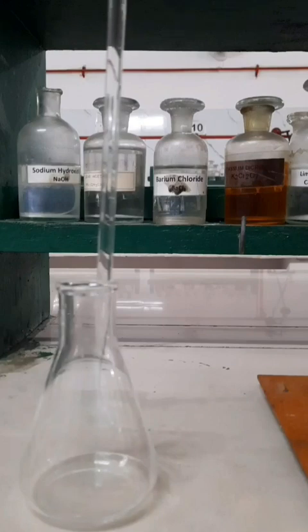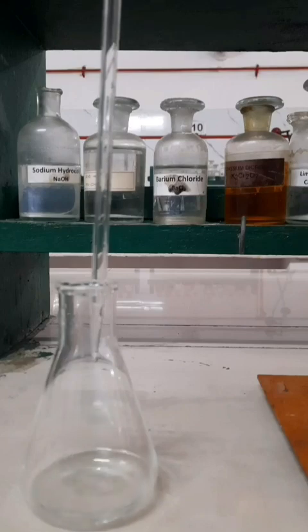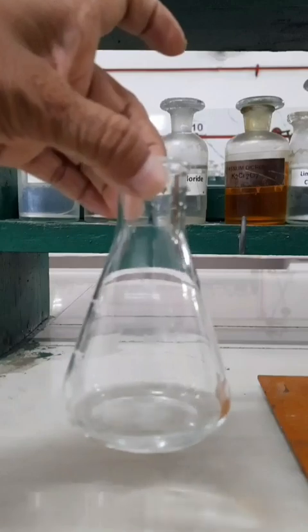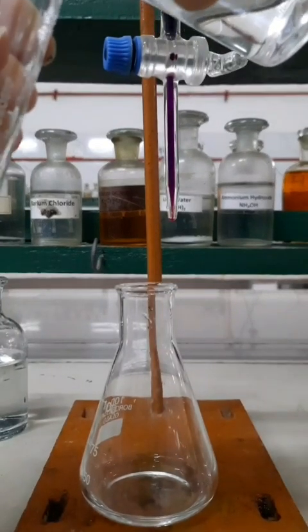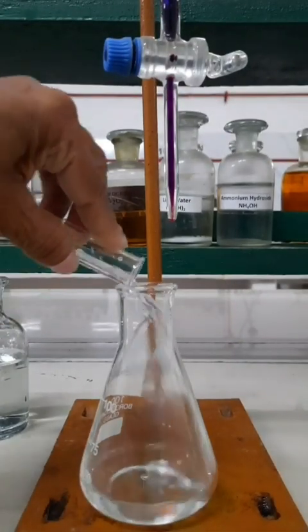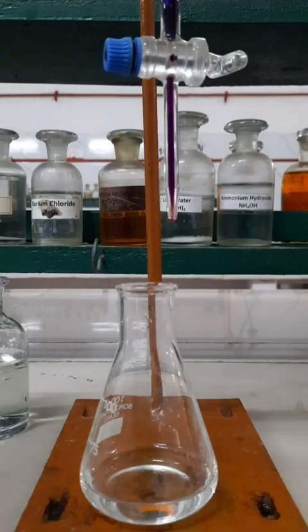Now let the liquid fall into the conical flask, and for transferring the last drop you have to tilt the conical flask and touch the base of the conical flask once, such that the last drop of the solution can be transferred. The total volume of Mohr salt solution transferred into the conical flask is 10 ml. Now I am adding 1 test tube full of dilute sulfuric acid into it. You have to add 1 test tube full of dilute sulfuric acid before titration.